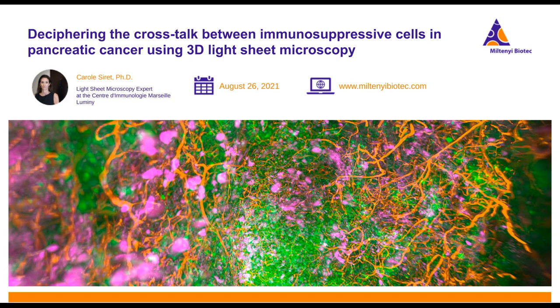Our next question is from Matthias. It says, but you are measuring nucleus distance to cytoplasm, so you can never be sure of direct interaction. No, in fact, Imaris does the measure from the centroid of the cell, so it's nucleus to nucleus. We hypothesize that lymphocytes are 10 micrometers in diameter, and MDSCs a little bit more, between 20 and 30, and we estimate that 20 is a good distance to be sure that the two cells are in interaction.